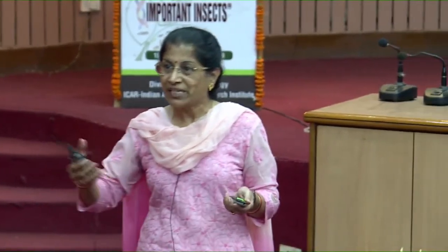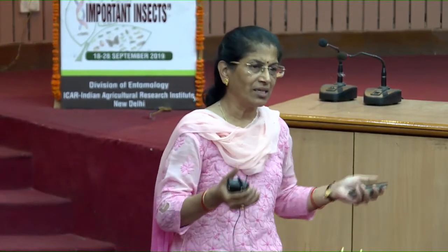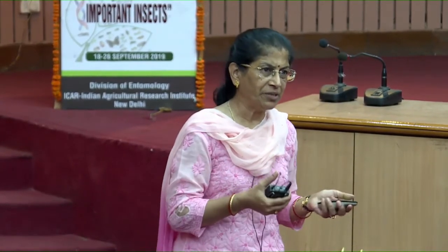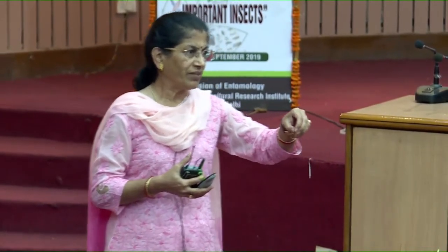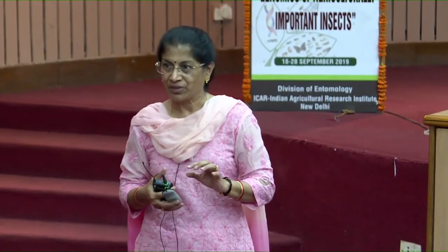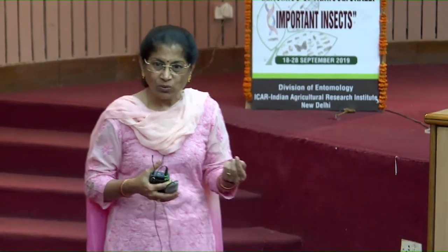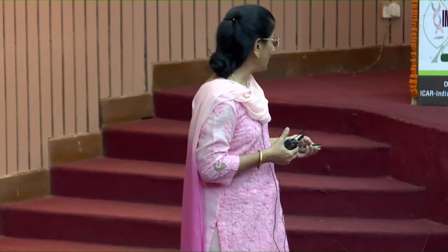I would do replications, because when you are using a MoBio kit as well as the bead beater, I would like to put at least 5 replicates. So I will take 500 mg of the same soil 5 times, do the extraction, and pool the DNA. Doing it just once, you may lose out on some and may not be completely representing the microbial population of that sample.